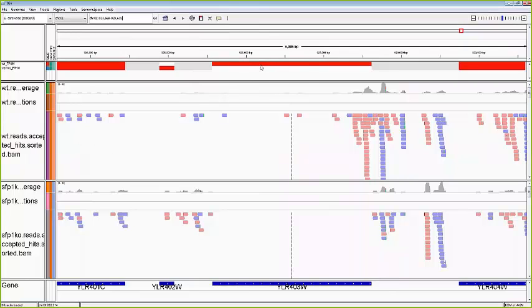So again, this is the gene expression. I can see here that in the wild type it's red, in the knockout version it's white. If I zoom in, I can see that it says value, the wild type value is 9.46. The knockout value is 0, so this confirms that this gene was knocked out. Also, if you're looking at the reads themselves, you can see that there are a couple of aligned reads in the wild type sample, where there's no reads in the knocked out sample. So this confirms that we have knocked out that gene in our knockout sample.